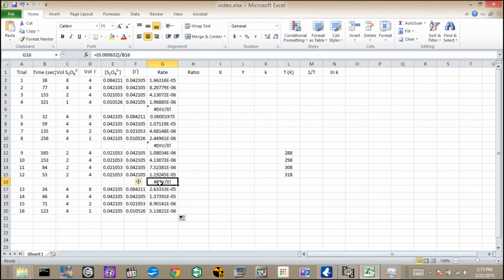And again, go back and get rid of the ones that we didn't use because I just left spaces to make this a little neater and a little more obvious which data sheet we're dealing with. Okay, so if you've done the calculations from the lab, following video number 1, then you should already have this data. It should not be a surprise to you. You should be able to check this and say, oh yeah, that's the number I got. I'm using sample data. Yours will vary slightly.